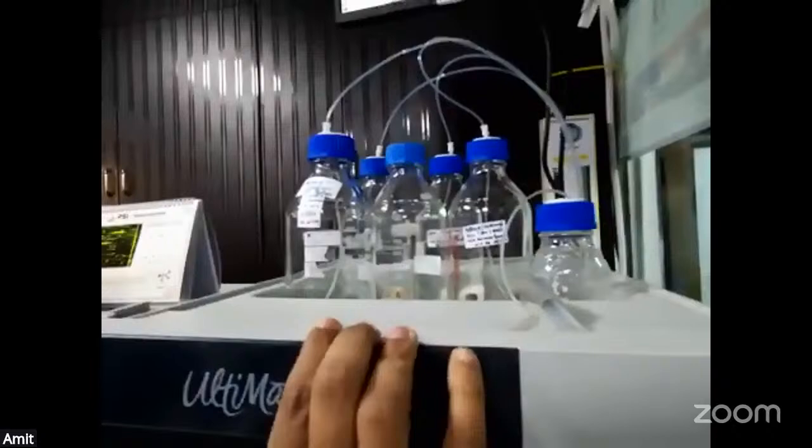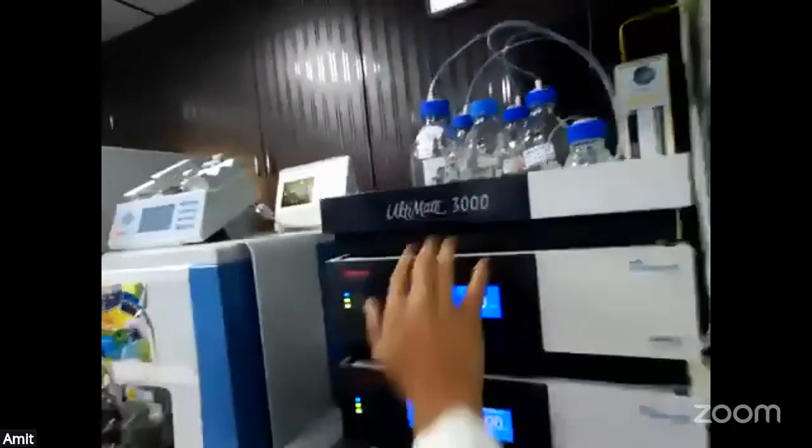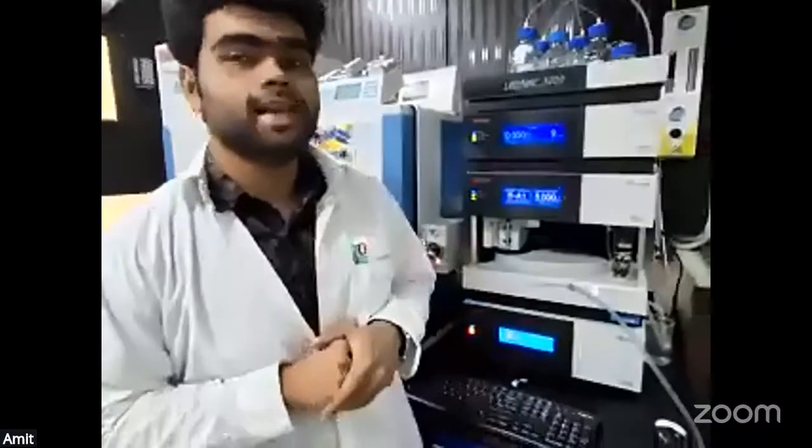In positive mode, we use 2 different solvents, solvent A and solvent B. In solvent A we use 0.1% of an additive to increase the protonated forms. But in solvent C and D, which are used for the negative ion mode, we cannot use any such additive.